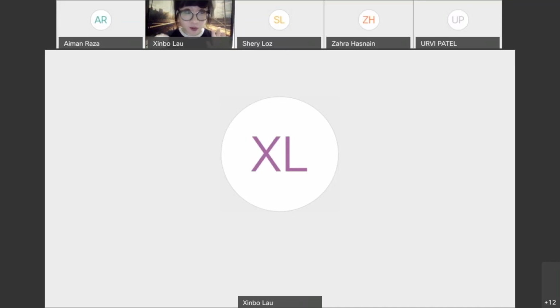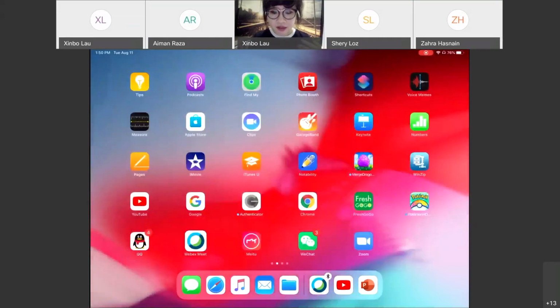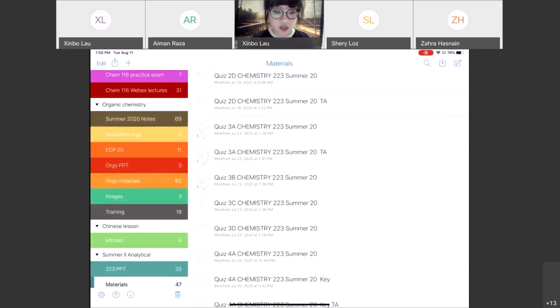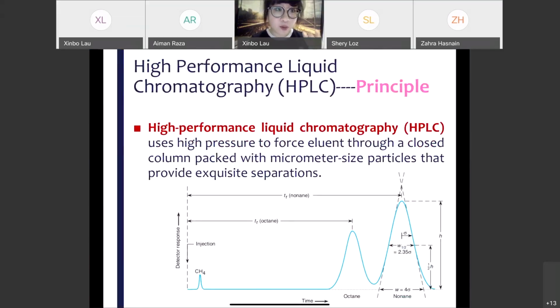Okay, so then again, you will need to apply the high pressure, and of course, pressure will be one parameter you need to look into when you actually use the HPLC. When we use HPLC, you turn the instrument on, you turn the detector on, and you need to wait 10 to 30 minutes to make sure the pressure gets stable. That's also one of the things, from principle, that we know and how to operate during the actual settings.